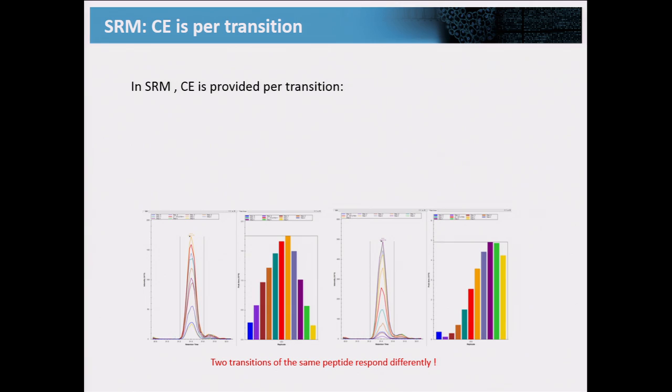What you can create is a chromatogram library that saves these peaks, in this case optimized by collision energy, and then these are going to be our reference, and we are no longer troubled by the difference of what machine we did this or that on. So you have this option in Skyline as well, but we don't cover it in any of the tutorials, but know that it's available and out there.